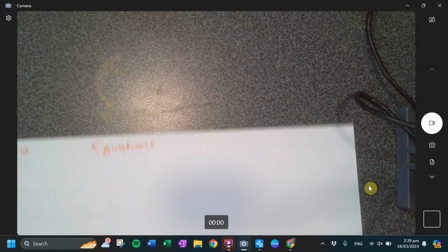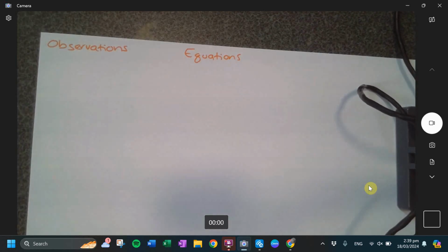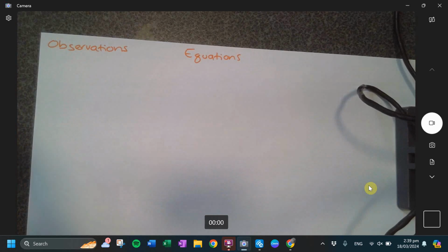when you are doing your assessment and identifying the unknowns, we know at this point that this is sodium sulfate because I've told you and we've grabbed it and we can see the label. If you were doing this in the actual assessment, there would be no label. All right? But the test that you have done would have told you it's sulfate. Okay? So what I want to write down is that I've taken my observations.